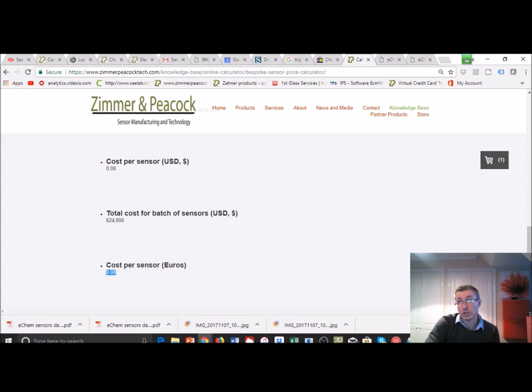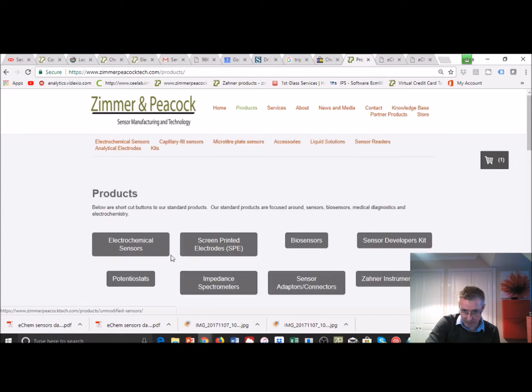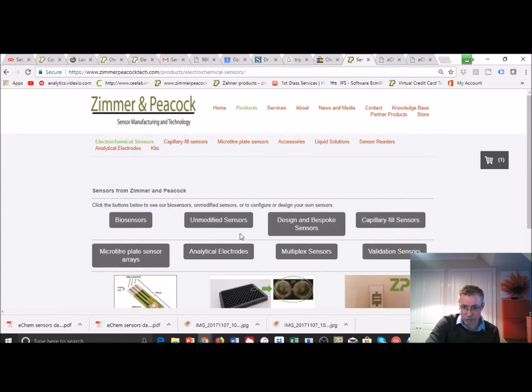Many of these ones I've talked about are actually manufactured at 850 degrees C, so they're really quite robust. And the ones that I've been highlighting are also designed to use an organic solvent, so they've got that resistance. There is a gap between what we've got and what will work, and the gap is somebody has to do that R&D and that research. But these are some of my thoughts around this.